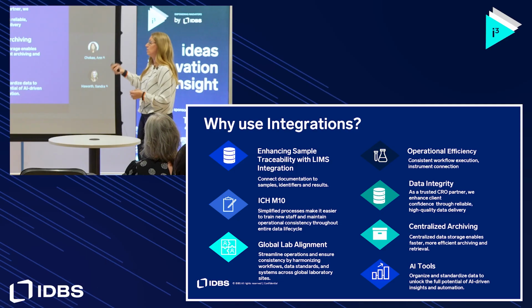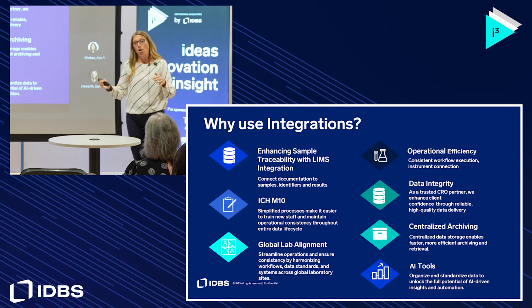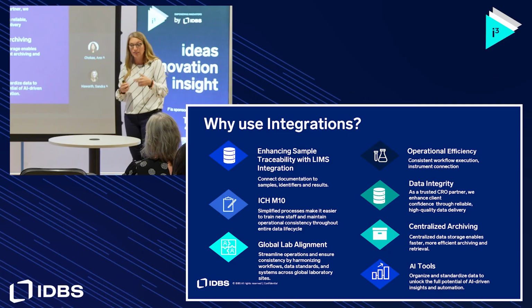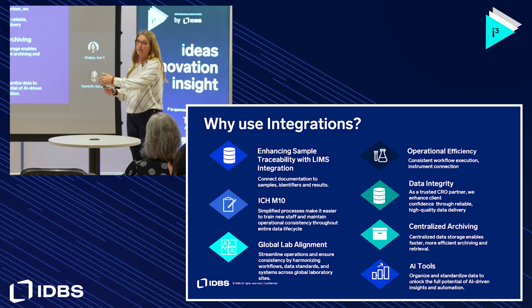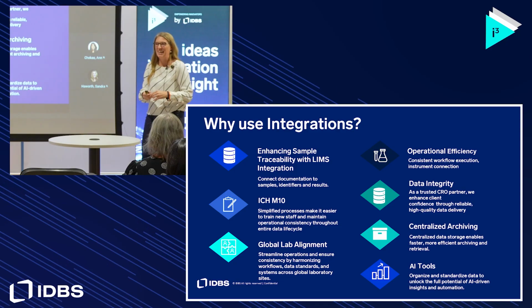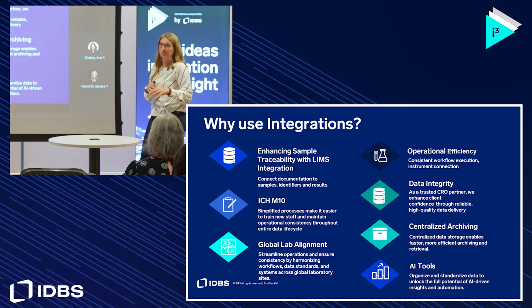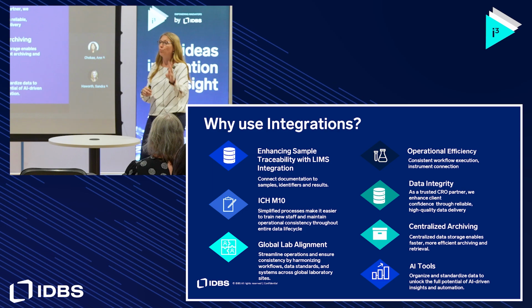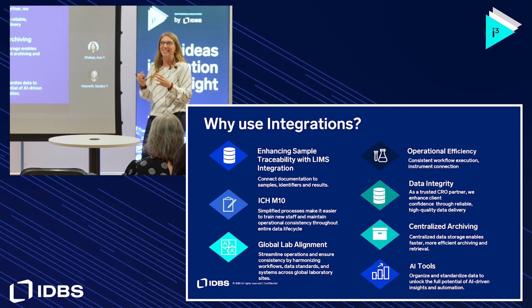And the other thing I wanted to mention is harmonization. Even though we're doing ADA in Indianapolis and RTP, it's really forced our sites to harmonize and think about what they've been doing in the past, think about new guidance that's coming out, and then we build into the template their best process or the decisions that they've made to harmonize. So they might not like it because then someone's got to change, but it really does help keep the number of templates down. So we have one method template for all sites, one reagent prep. We don't have site-specific templates. And I think for anyone who builds templates, that's the goal.